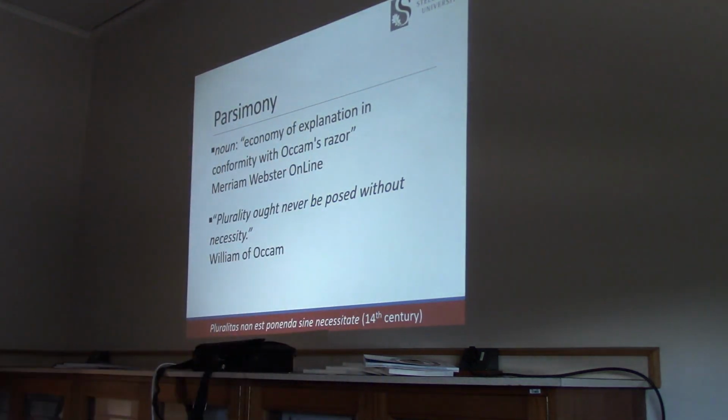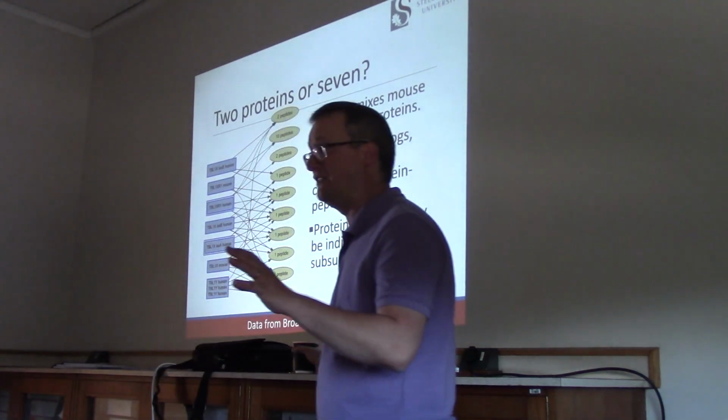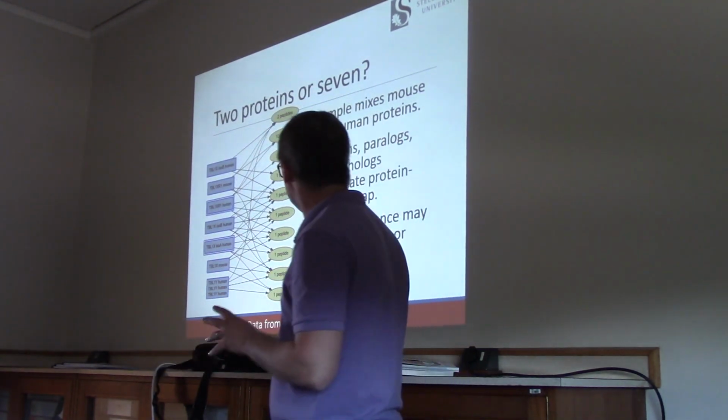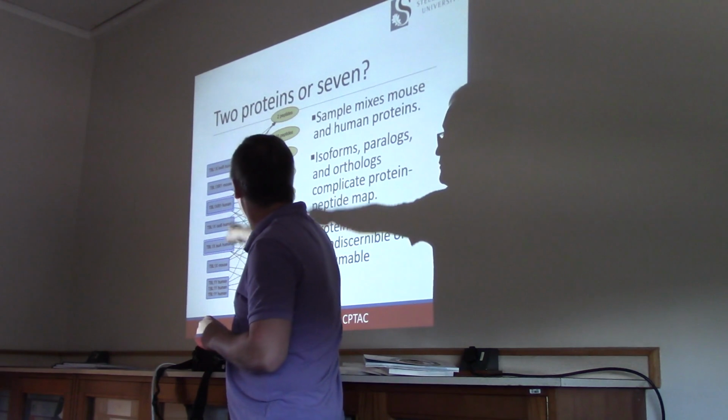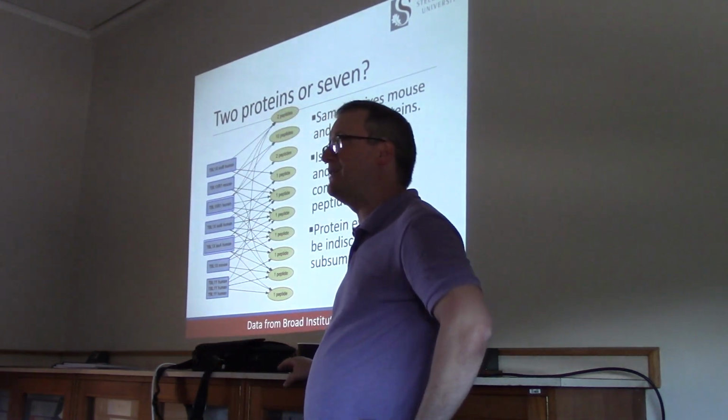All right. So how does that work? There are lots of ways that this untangles. I'm going to be relatively brief about this. But I want you to imagine that the evidence we've accumulated through tandem mass spectrometry has a big list of peptides. Oh, did I make no sense there?